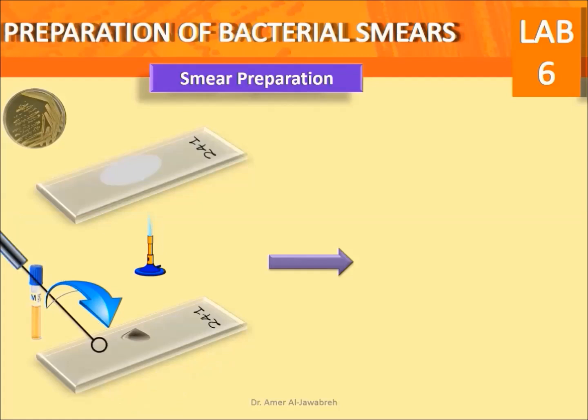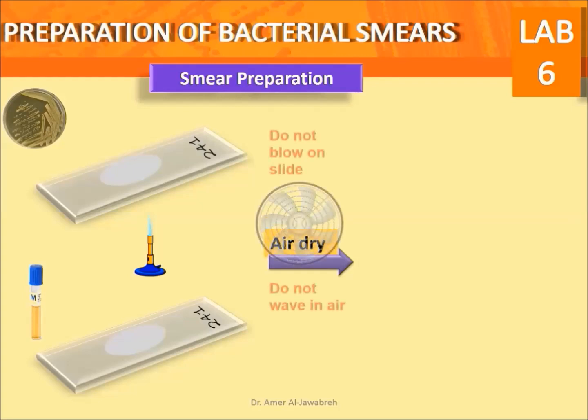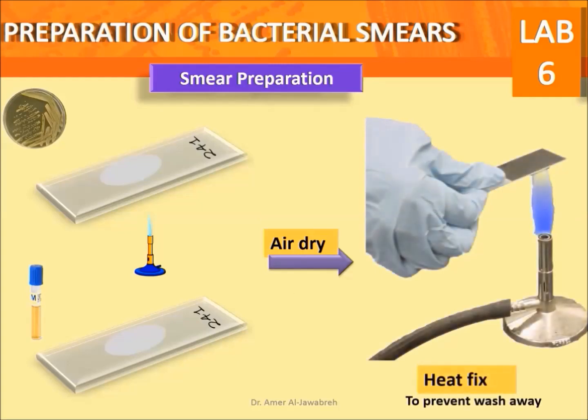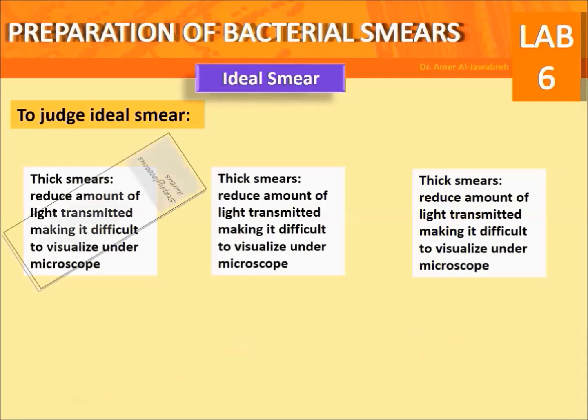Smear preparation from broth: place one to three loopfuls of cell suspension on the center of a slide. Spread in a circular motion using a loop to form an oval shape. Air dry — do not blow on the slide or wave it in air. Heat fix by quickly passing the slide two times over the flame.